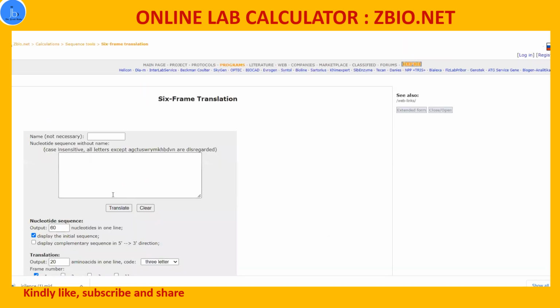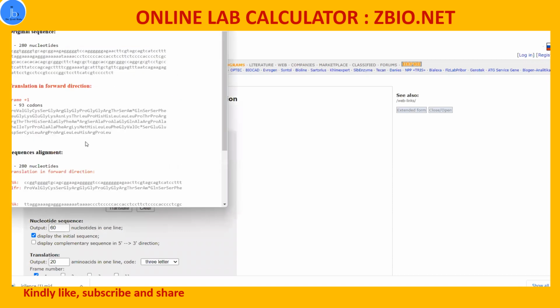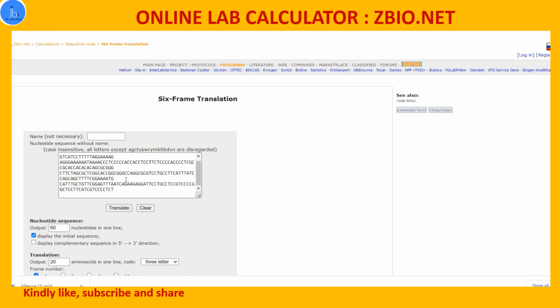If you want to get ideas about the 6-frame translation, like from nucleotide, what protein will be translated. I'm taking a random sample right now, but you have to take into consideration your gene and ORF, everything, when you are handling the actual samples. So based on that, from your nucleic acid, the gene, you can get ideas about what protein will be translated. Right now, for display purposes, I have taken a random sequence, but for your actual gene, you have to take the right gene sequences.